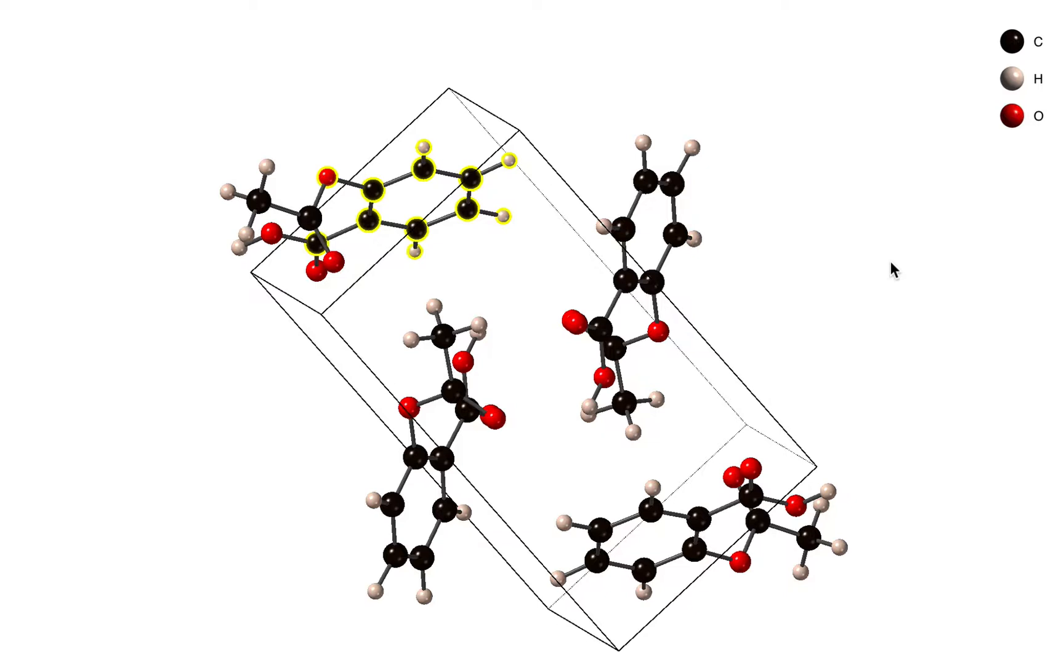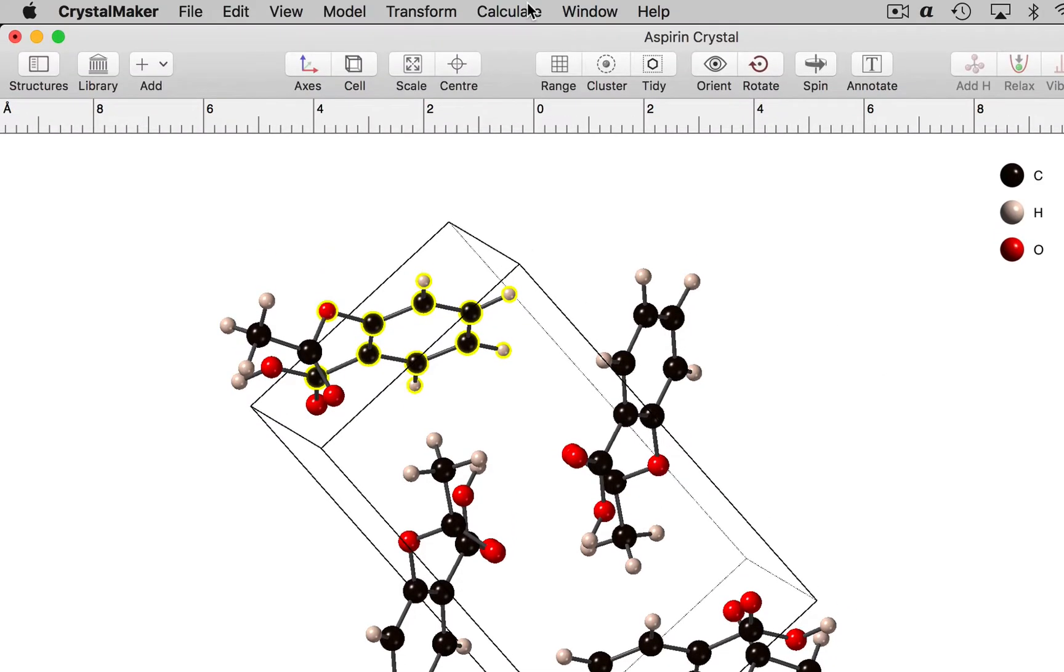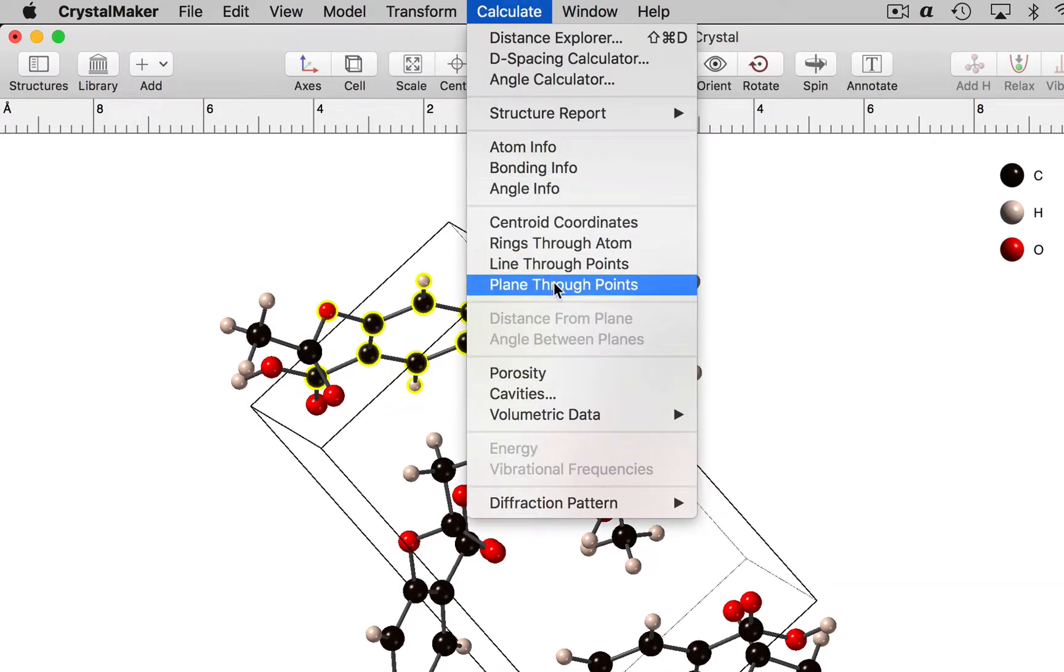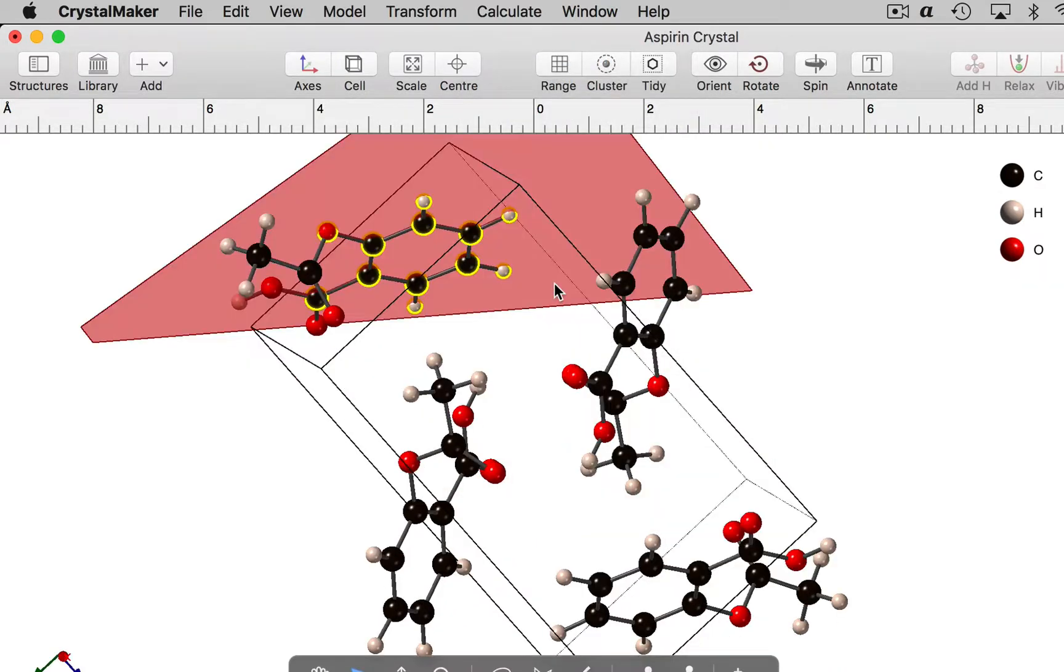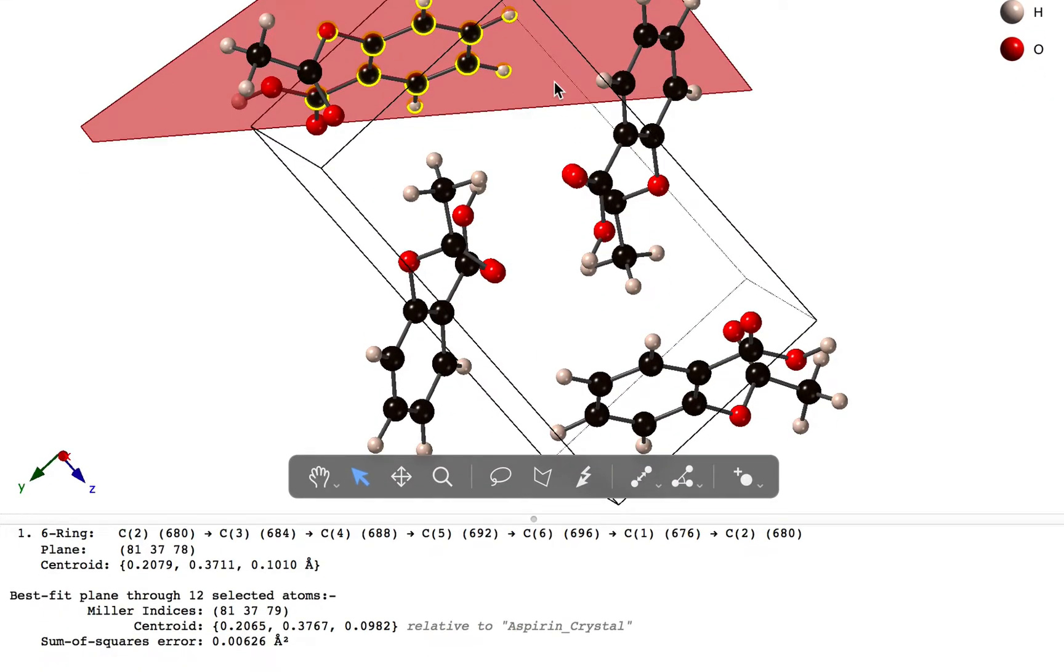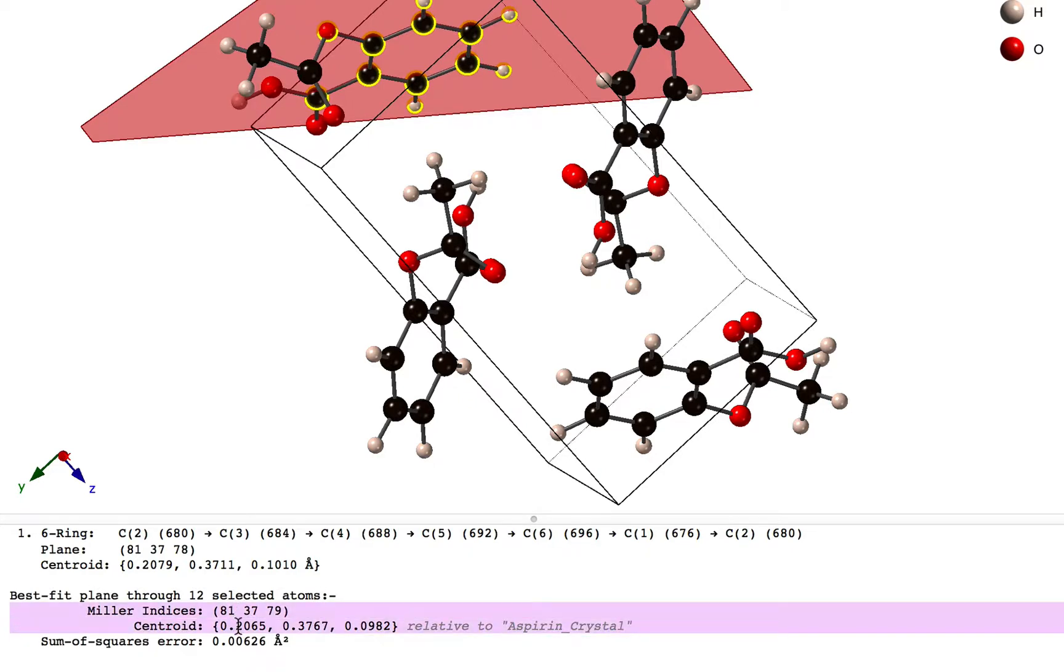Now I want to fit a plane through these atoms, so I'm going to use the calculate plane through points command. Now we have a best fit plane through those atoms. The parameters for the plane are described at the bottom of the screen. We have the indices, we have the centroid, and we have a sum of squares error.